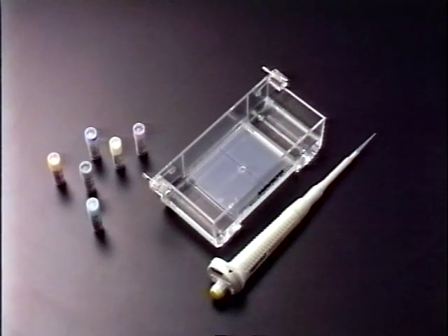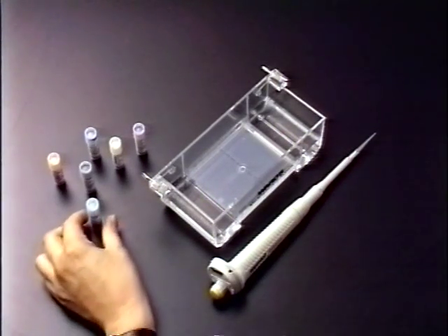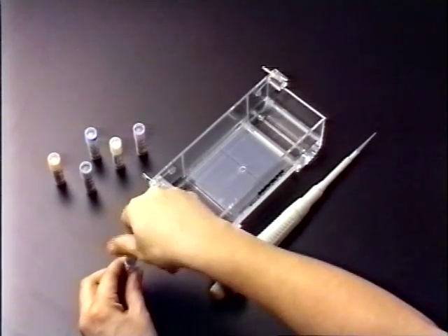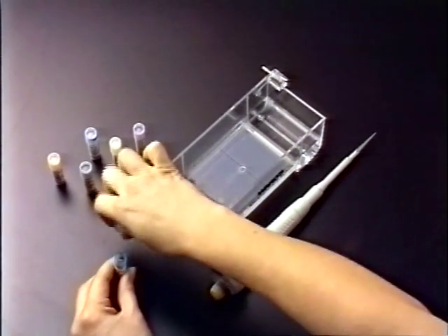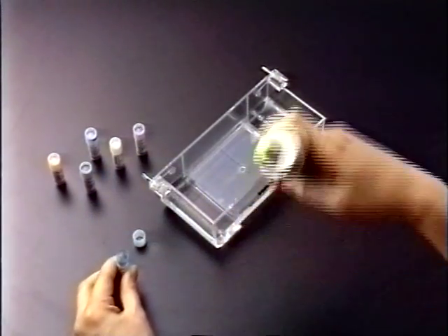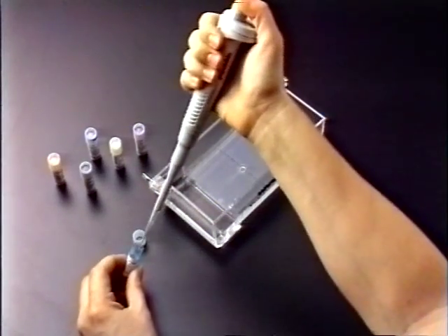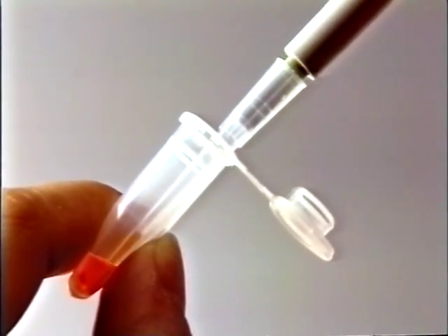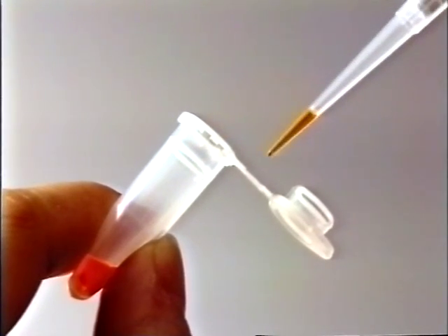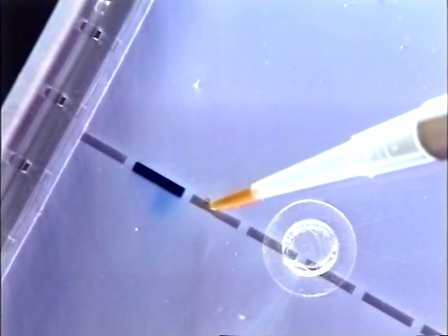The samples used in electrophoresis should be measured carefully. Use a micropipette to draw a measured amount. Draw 10 microliters of sample into the micropipette tip. When loading, be careful not to pierce the bottom of the well.